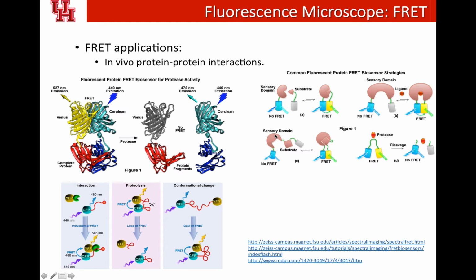Based on a similar principle, many biosensors have been developed. For example, the first one is similar to this example, basically trying to see the binding effect. And the second one is a small molecule binding with a sensor domain.